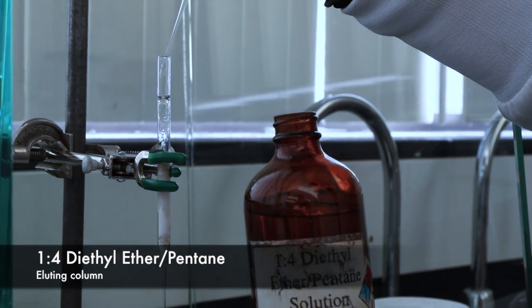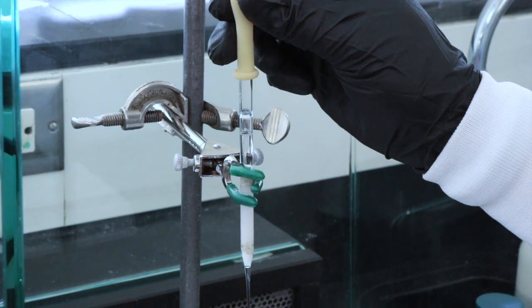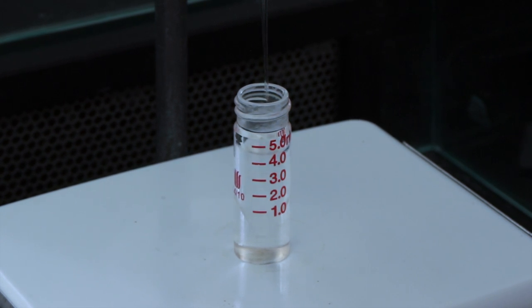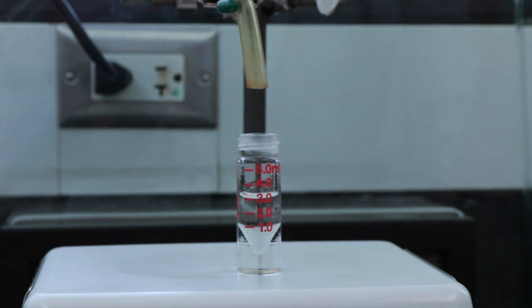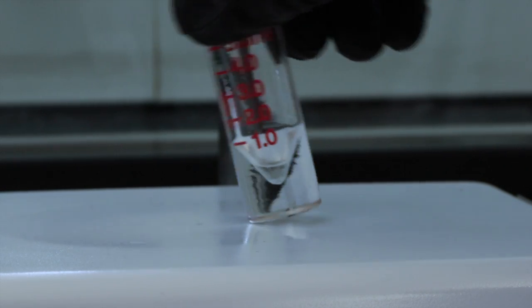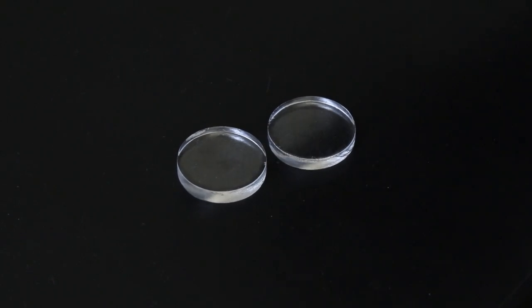For that, I'll be using a 1:4 ratio of diethyl ether pentane solution, and I'll attach a bulb to the top of the pipette so that I can push that through. I'll gather about 5 milliliters of solution just to make sure that I got enough product out. And then we can evaporate the solvent again, hopefully leaving behind our purified product. And it looks like I barely got enough to take an IR, which is totally fine. I'll weigh the conical vial with the product in it, which looks to be 26.321 grams. Now I can run a quick IR to see how well I isolated the product.